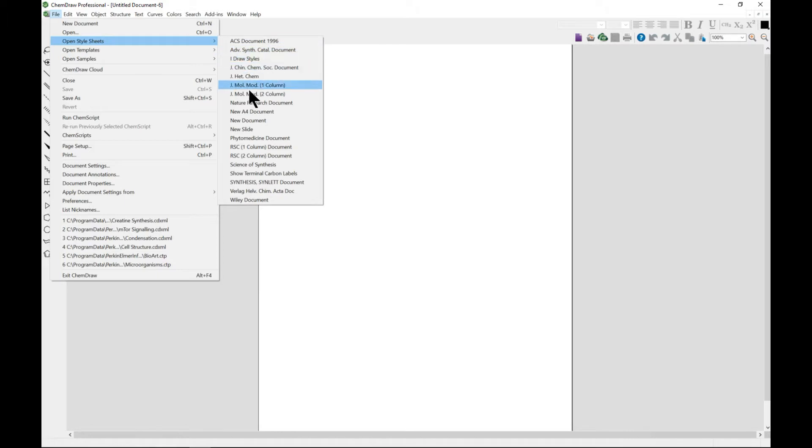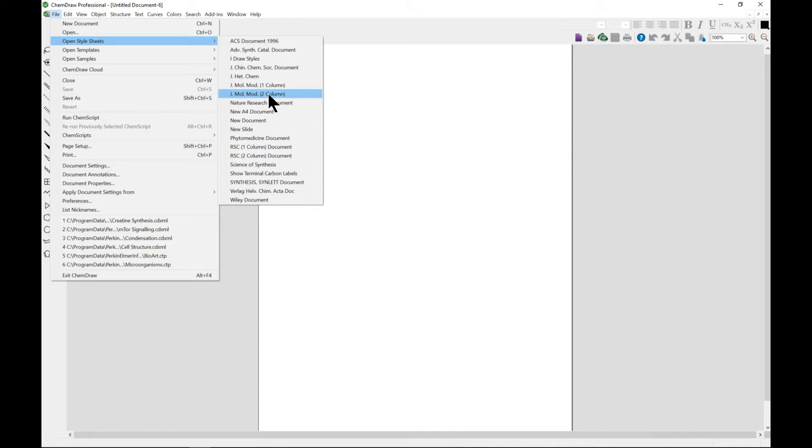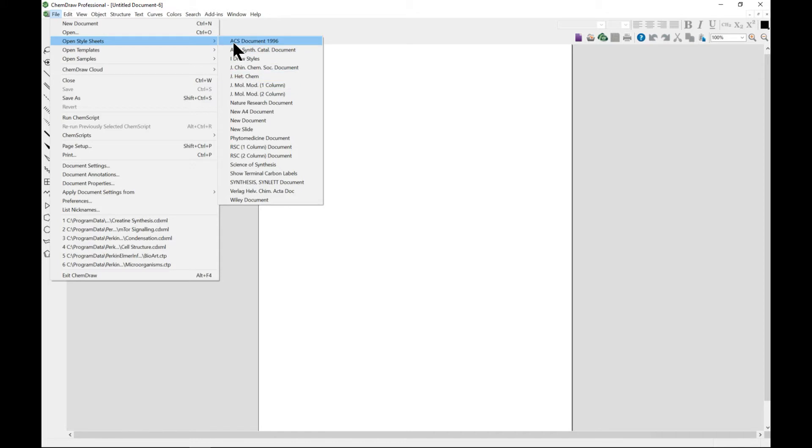All these are formats that some journals and books require, so they have preset parameters. For instance, if you choose an ACS document, it has a fixed length of 14.4, so you can check if you need those.